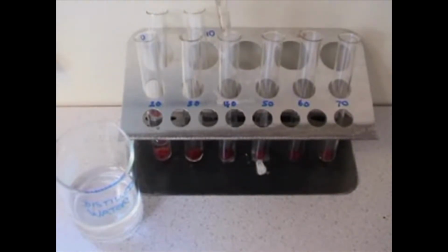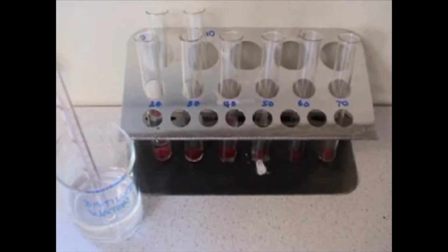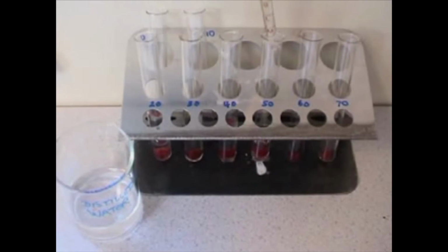Now, added to each test tube 10 centimetre cubed of plain distilled water. Equal volumes need to be added to each test tube in order to keep the experiment as a fair test. Notice I made a point of saying volumes of water and not amounts.